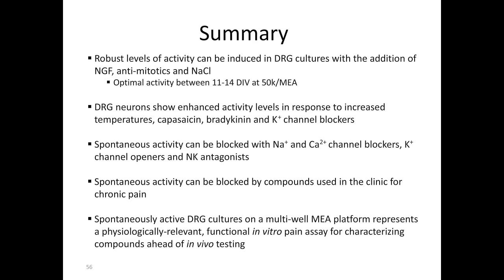And so this does represent a platform that's physiologically relevant and a functional in vitro pain assay that can be used for characterizing compounds. I really want to harp on the point that this is looking at endogenous excitability within these DRGs, since there doesn't seem to be much neurotransmitter release, anything that's going to target that pathway in the spinal cord for neurotransmitter release, such as these higher threshold calcium channels, would not be expected to have an effect, as we showed. But this really is looking at intrinsic excitability of the DRGs and how you can target that to reduce spontaneous activity and hopefully reduce ectopic pain discharges.